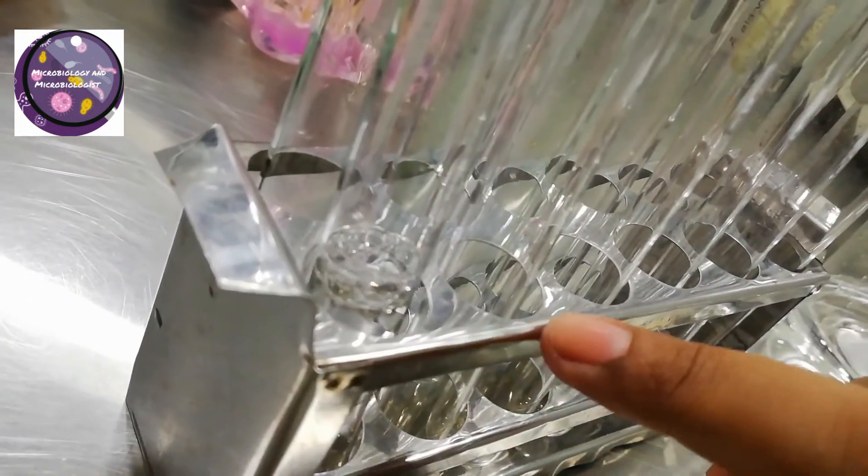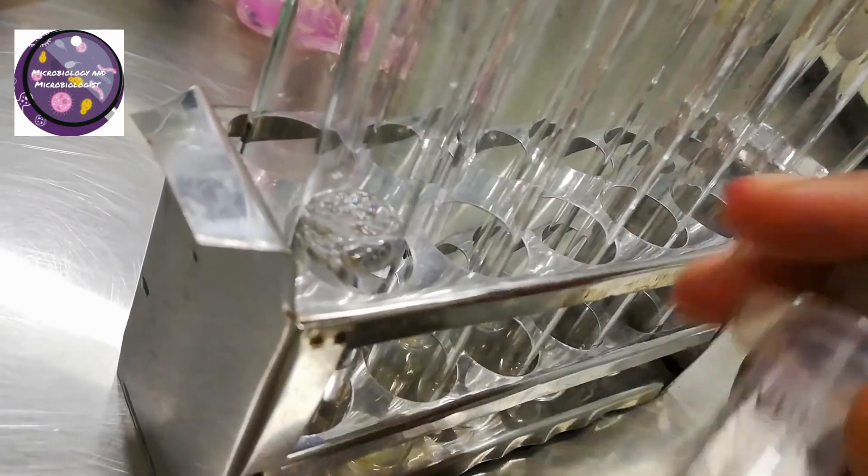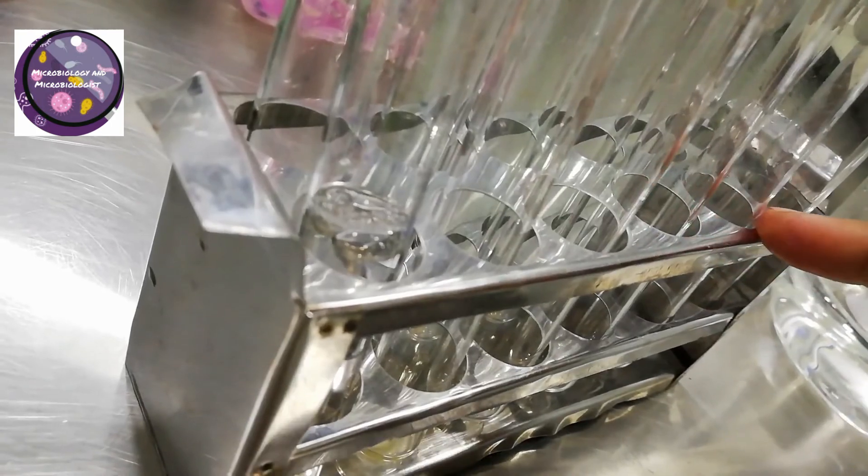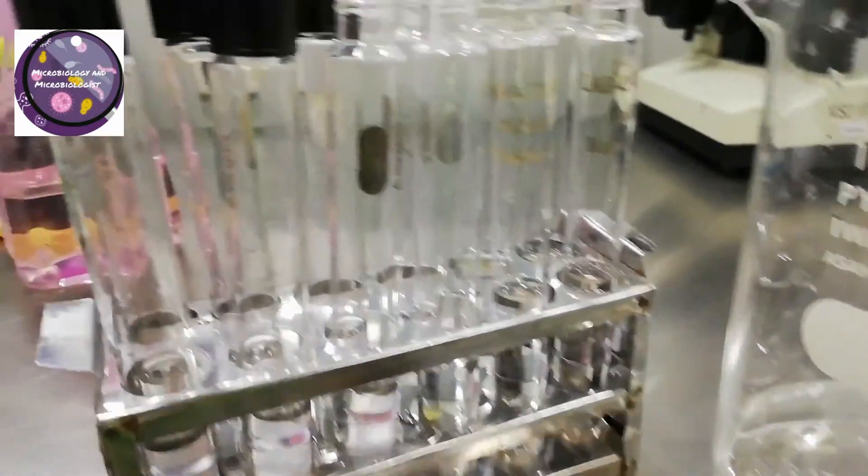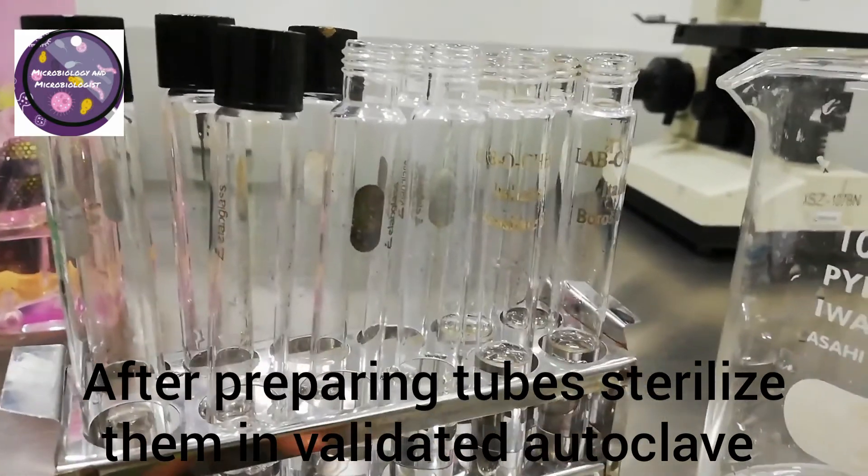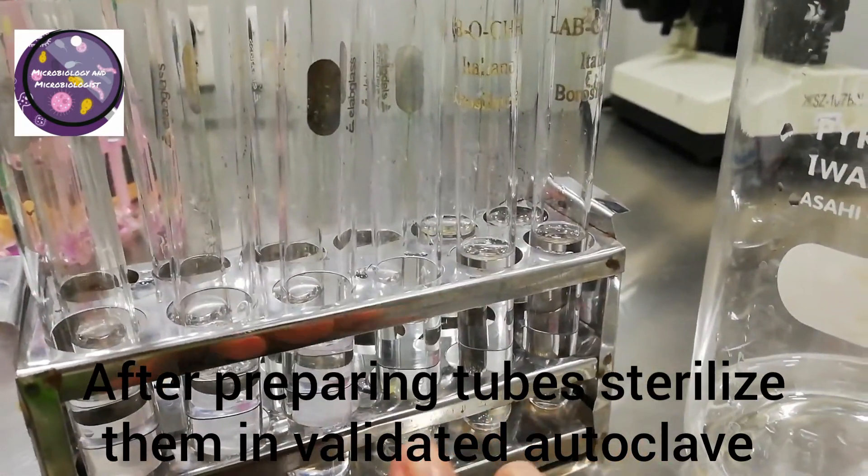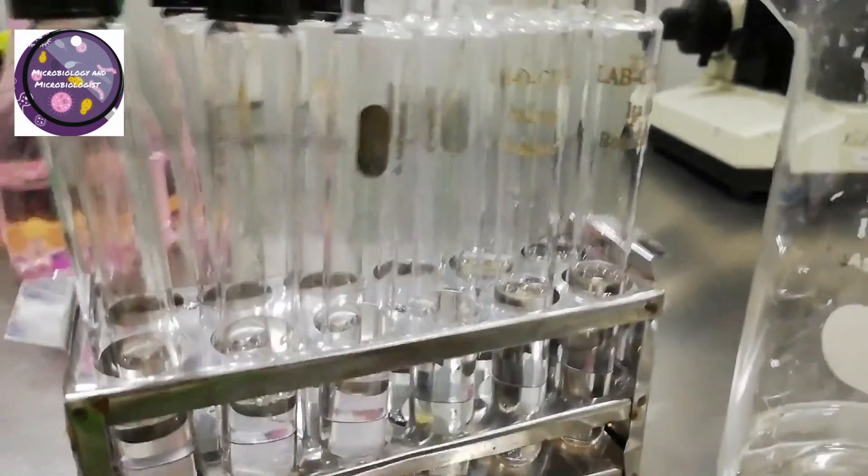For serial dilution, we are going to add 9ml in all these 15ml culture tubes. After filling the tubes, I am capping them.